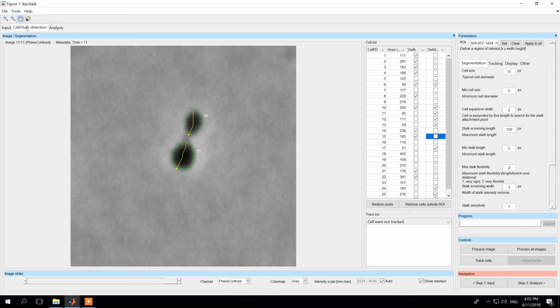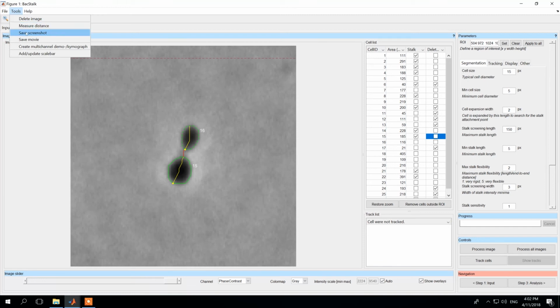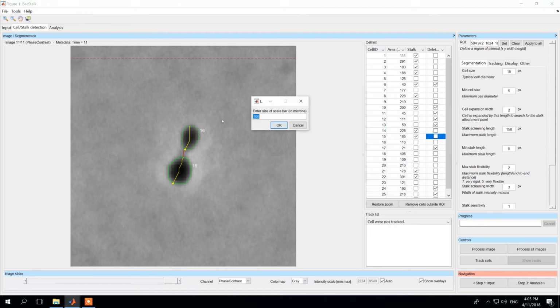Now there is the option to use the pen to navigate a little bit and to make some measurements. And these measurements can be done or indicated both in pixels, which is really useful for the parameters for segmentation, which will be explained in a more advanced tutorial, or in microns. Then one can delete this again. Then a scale bar can be added, and one can give the size in microns for this.